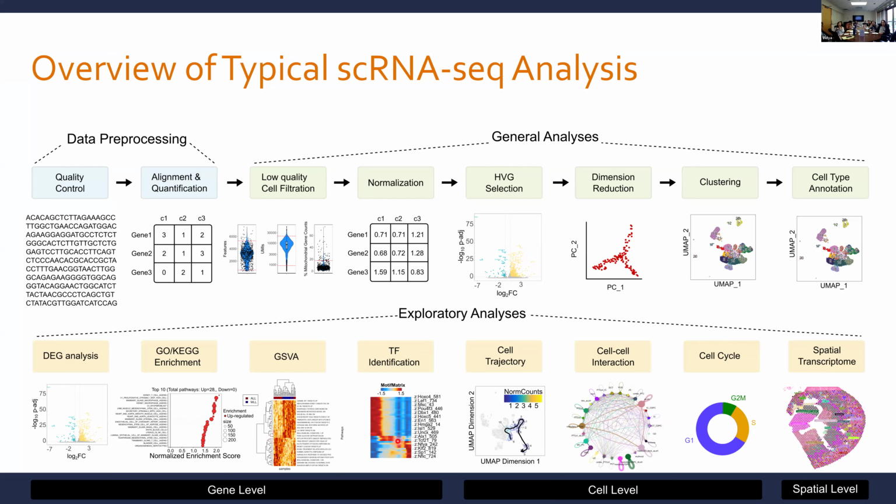And then you can also do things like establishing a trajectory. So you can essentially pick, I'm starting here with this cell population based on prior knowledge, and I'm ending over here, and let the algorithm try to decide which populations of cells I'm going to go through to go from that starting point to the end point. And so that can be really fascinating, because you can see through either time, whether it's developmental time or differentiation, what's changing along that trajectory.